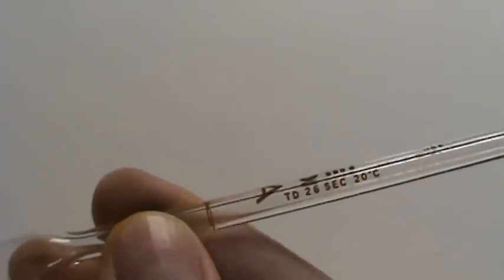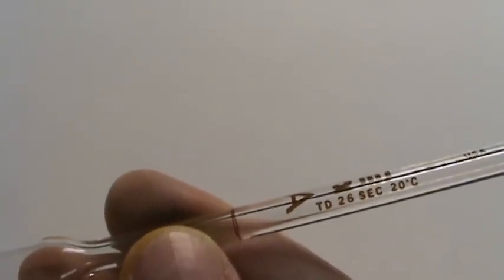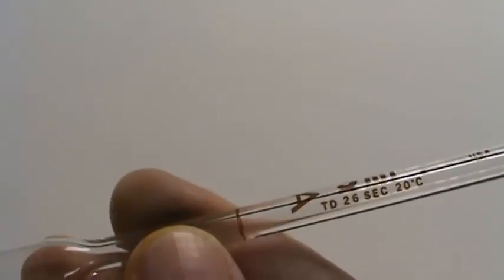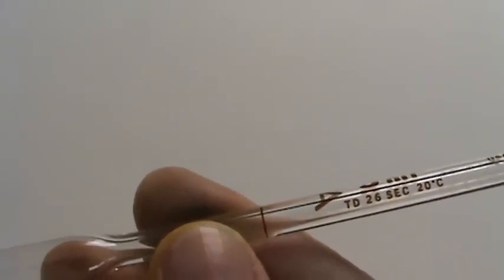And like with everything else, let's make sure that we read the rest of the label. This is a class A pipette. That probably doesn't mean a whole lot to us right now. It's five milliliters. It's made by Chimax in the USA. And what else does it say?